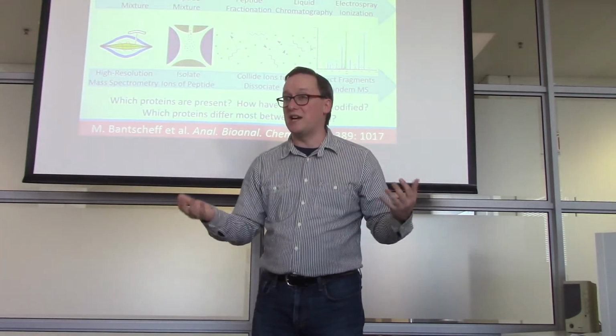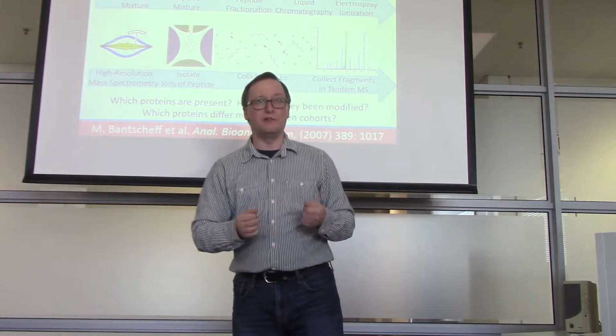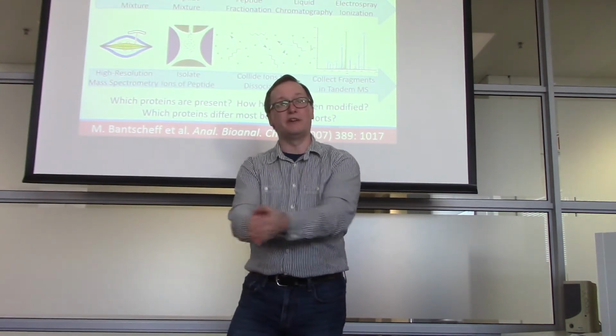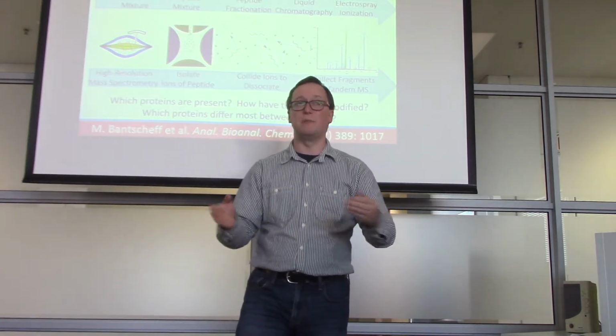So different peptides from different places in a protein are going to differ in their hydrophobic profiles. So we can use that to separate them in time such that the least hydrophobic peptides come off the column first and the most hydrophobic peptides come off the column last.